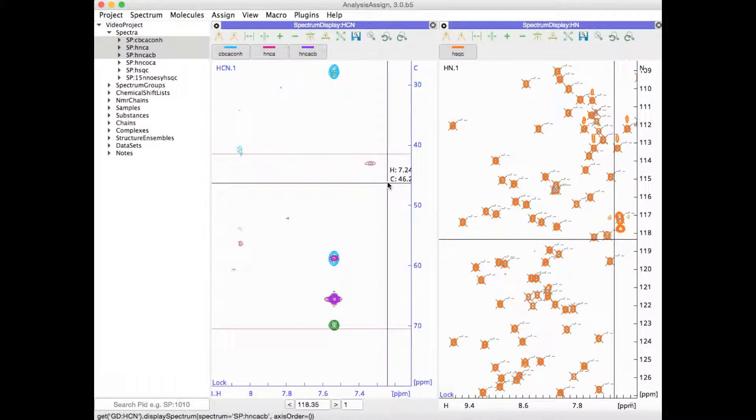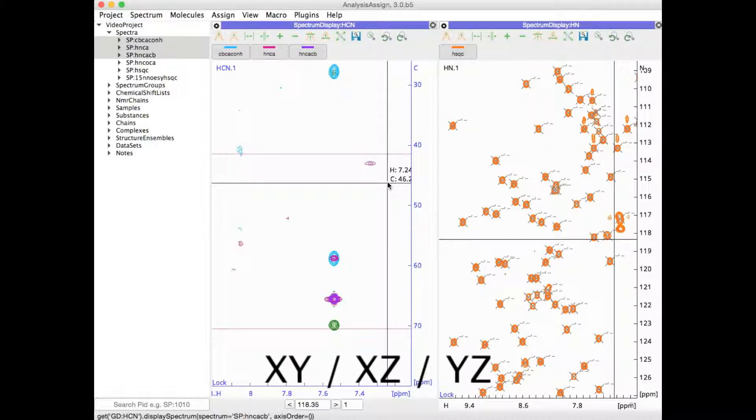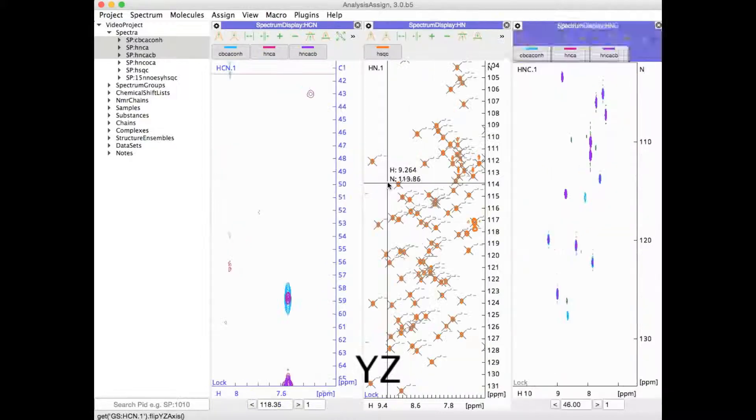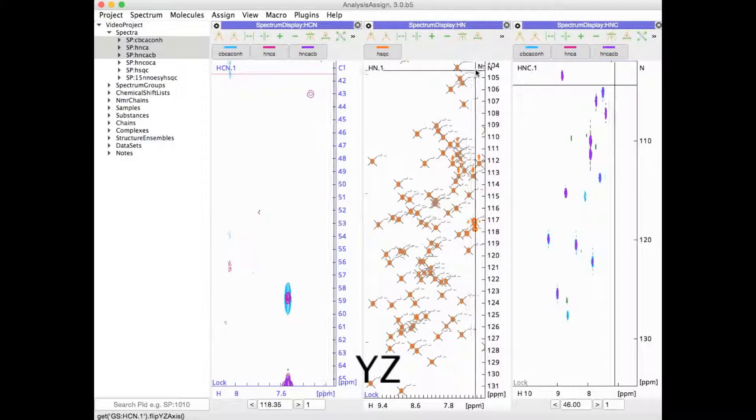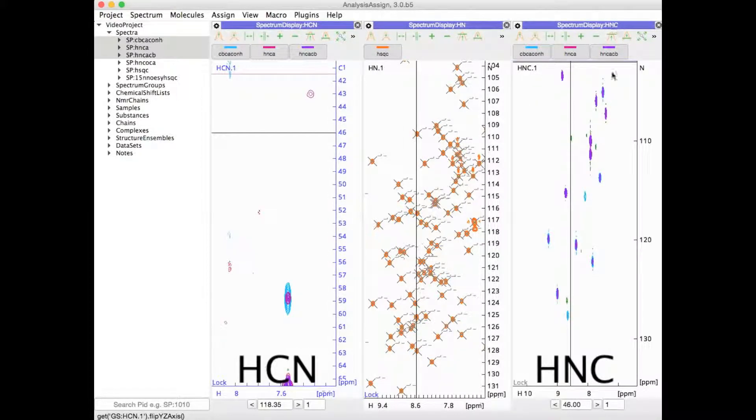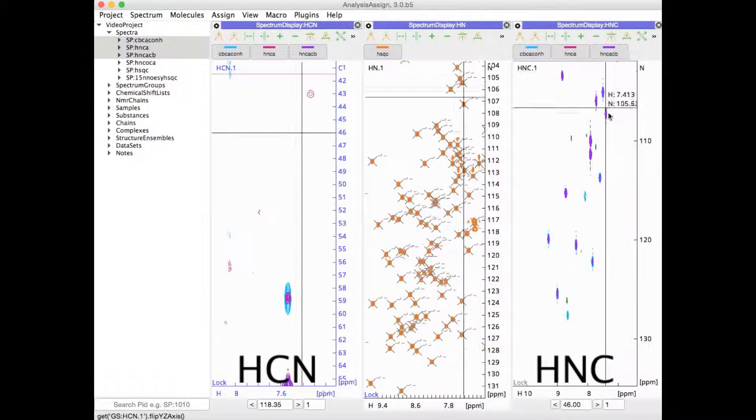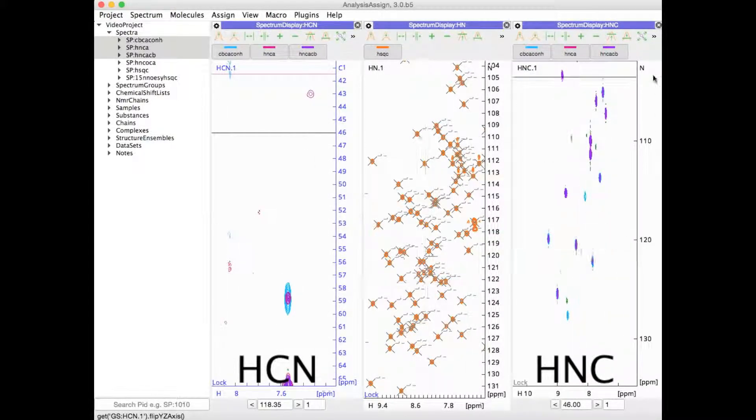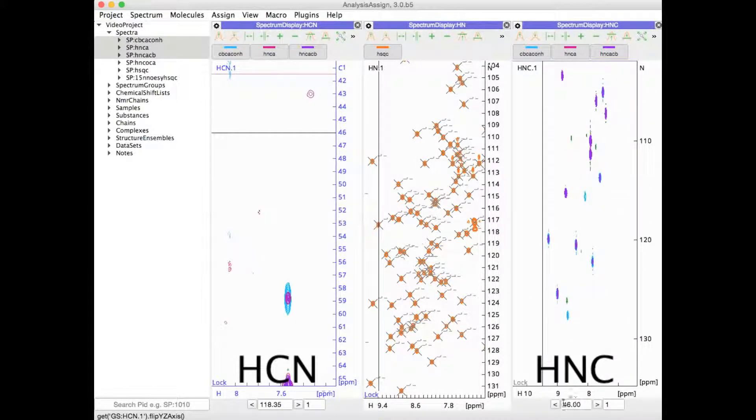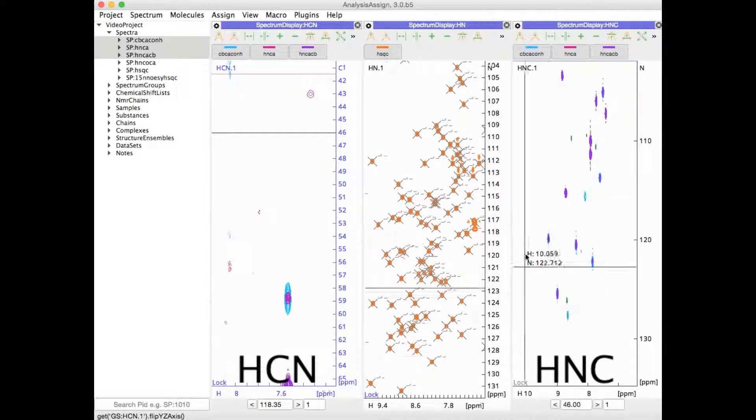You can use XY, XZ or YZ simply to flip two of these axes. For instance, with YZ, I flip it and now I've got an HNC display with nitrogen along the y-axis and carbon in the Z-axis.